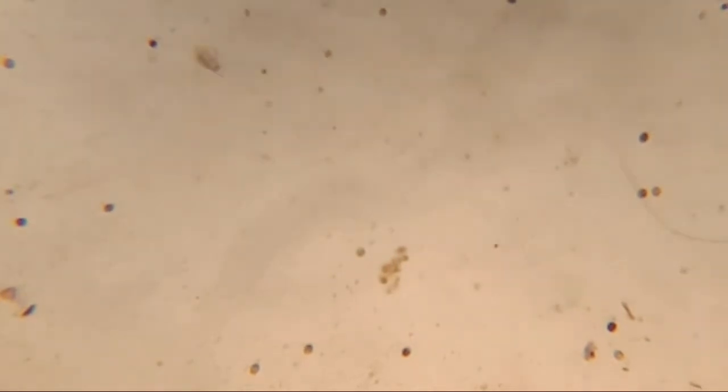So right now we're at 200 times magnification. Let's show you guys the critters that you could actually see with your bare eyes, the naked eye. Oh, there it goes. It might be so big that it doesn't even make sense to look at under the microscope, but I wanted to try to catch these for you guys because cyclops are pretty cool. And I thought maybe they'd have some babies in the water for us. Oh, we got a little worm — and you guys saw that this is just a little smudging of algae.